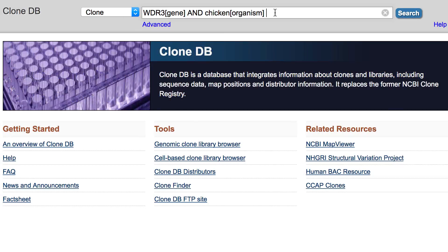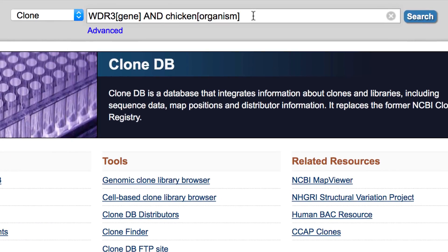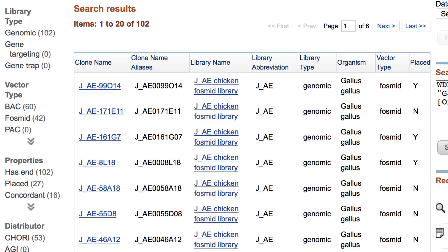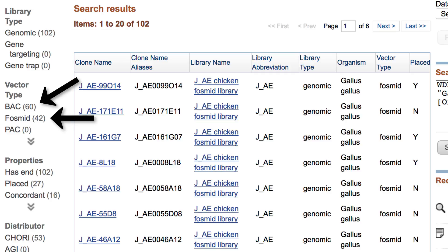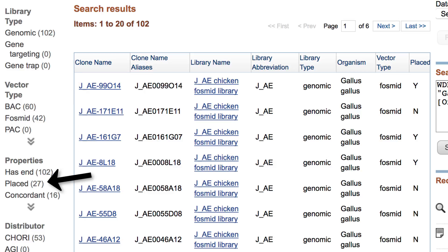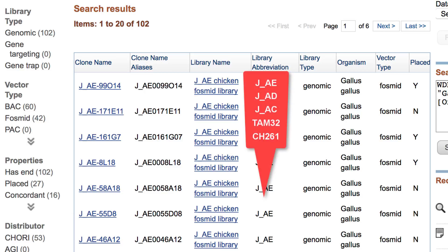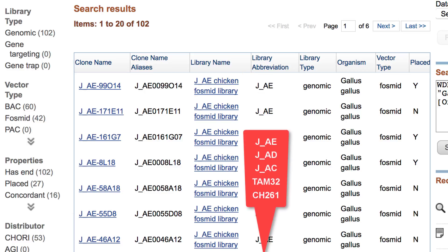Let's first find clones for the WDR3 gene in chicken by searching CloneDB with this query — WDR3 with gene in square brackets, and chicken with organism in square brackets. On this day, that search returned 102 records. The filters on the left show these are all library type genomic from two vector types, BAC and FOSMID. We also see that 27 clone ends have been placed, and 16 of those are concordant. All 102 end clones are from five different libraries.